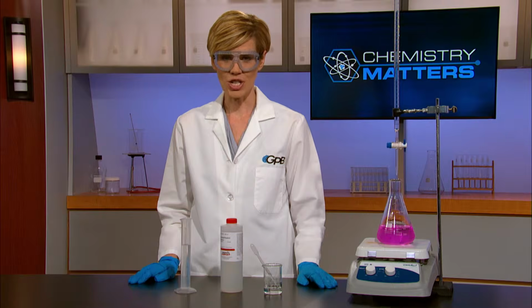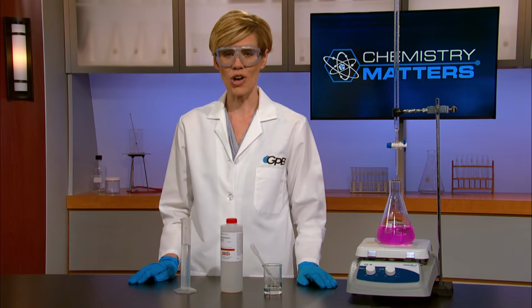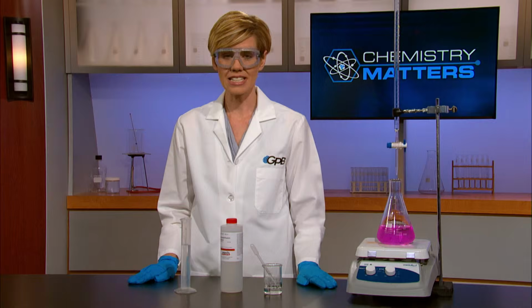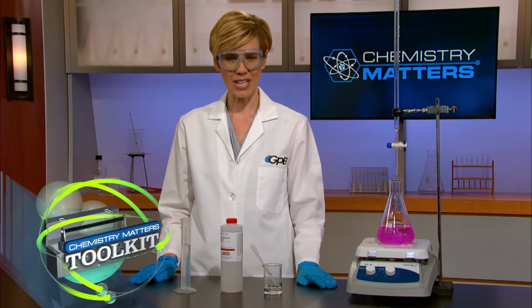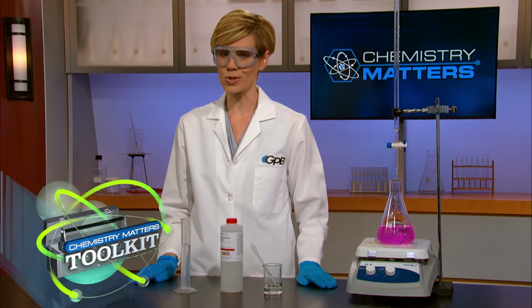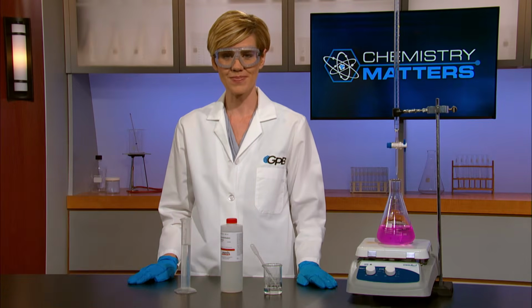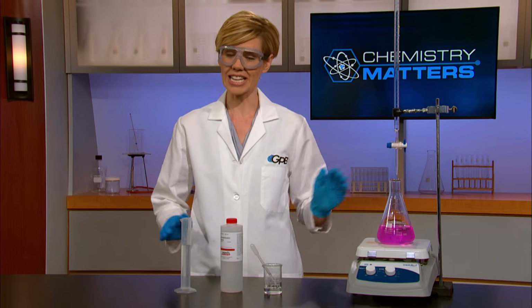The goal of a titration experiment is to determine the concentration of a base or acid. In this lab, you'll be solving for the concentration of the base. You'll be given an acid of known concentration to be used as the titrant. So let's head back to our classroom, where our students are using materials from our Chemistry Matters toolkit to get some hands-on practice with titrations. While you do that, I'm going to continue doing some titration work in this lab.